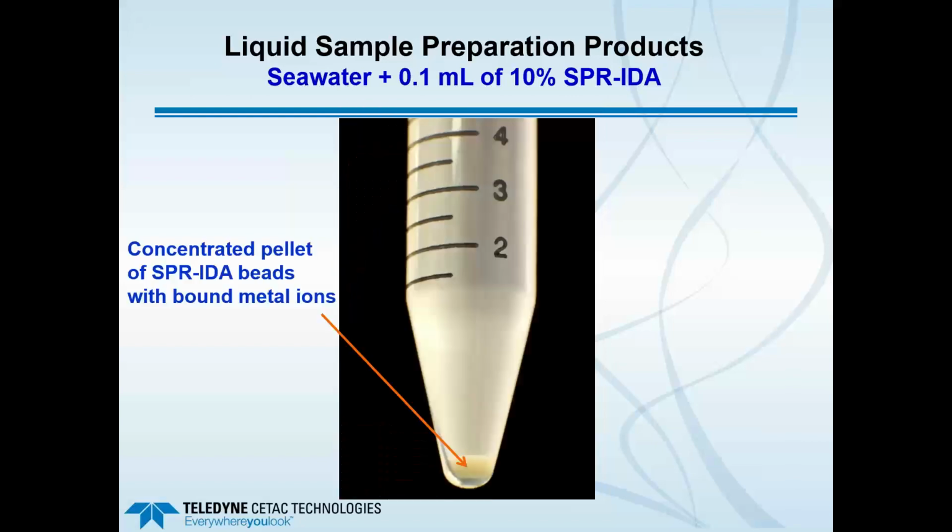Then as you allow it to settle, you can see the concentrated pellet of the beads, or the solid phase reagent and bound metals, move to the bottom. Of course, that will happen over time by gravity, but you can accelerate this if you place it into the centrifuge.